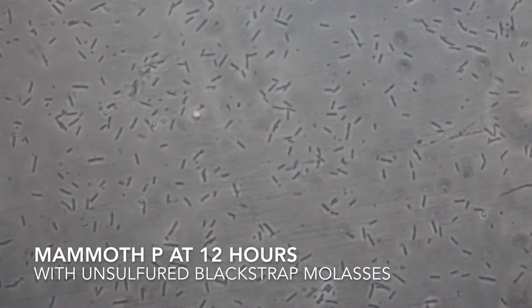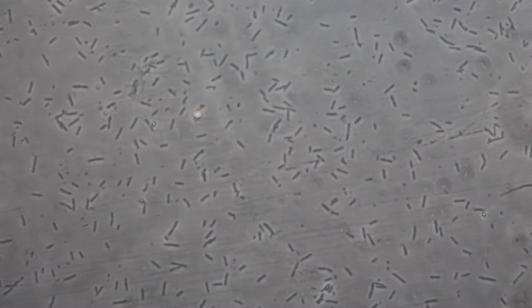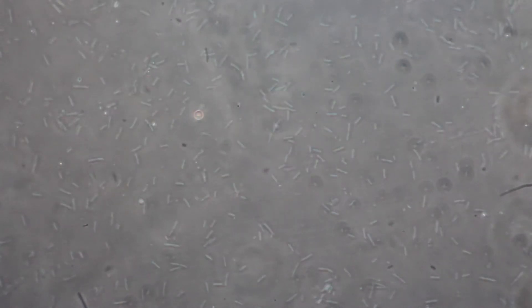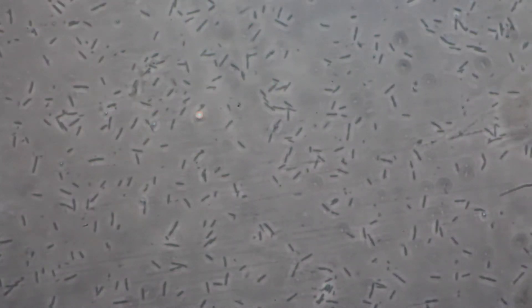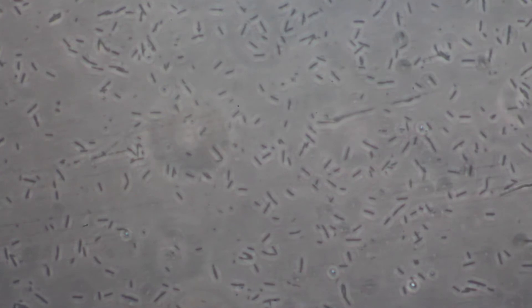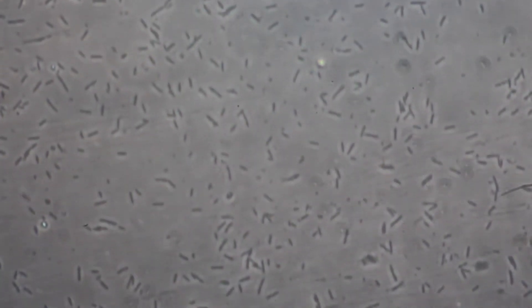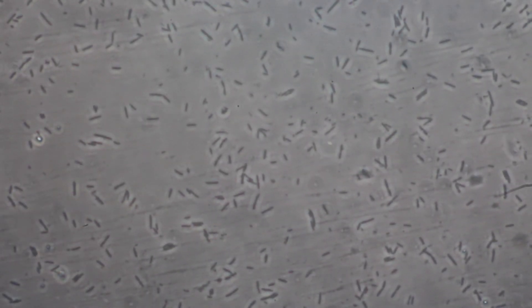Here's the Mammoth P again — this time I've added a small amount of unsulfured blackstrap molasses. As you can see, there's quite a bit more activity with the added food source. Pretty much the whole slide looks about like this.